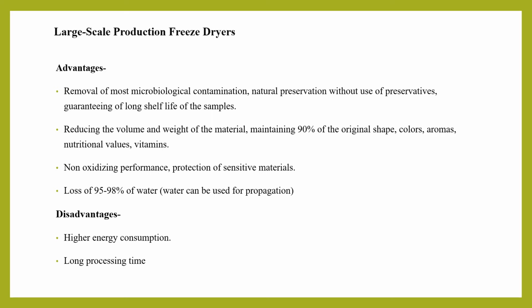Advantages of this large scale production are removal of most microbiological contamination, natural preservation without the use of preservatives, guaranteeing a long shelf life of the samples, reducing the volume and weight of the material, and maintaining 90% of the original shape, colors, aromas, nutritional values, and vitamins. Some disadvantages are higher energy consumption and long processing time.